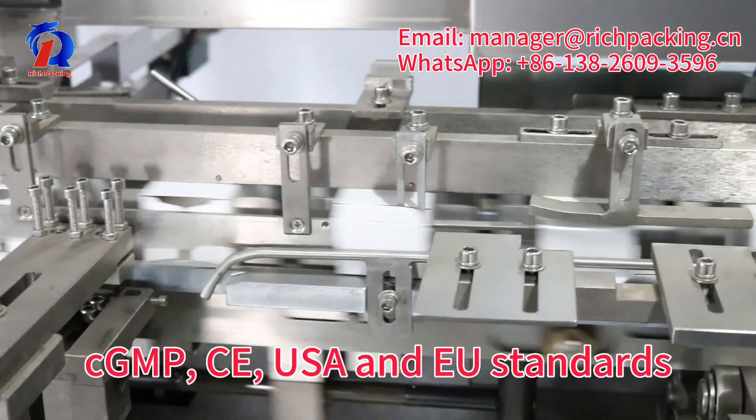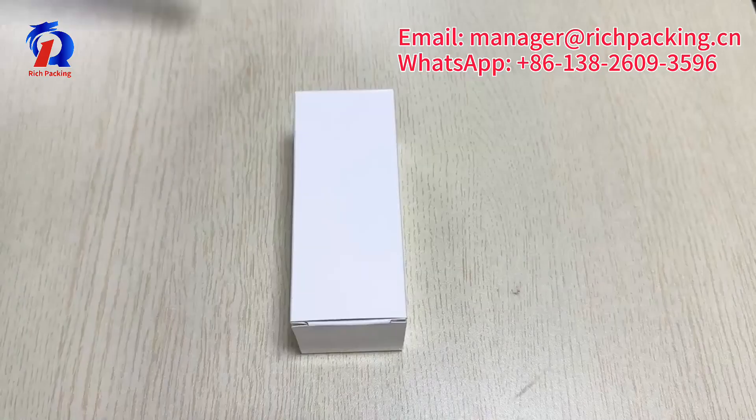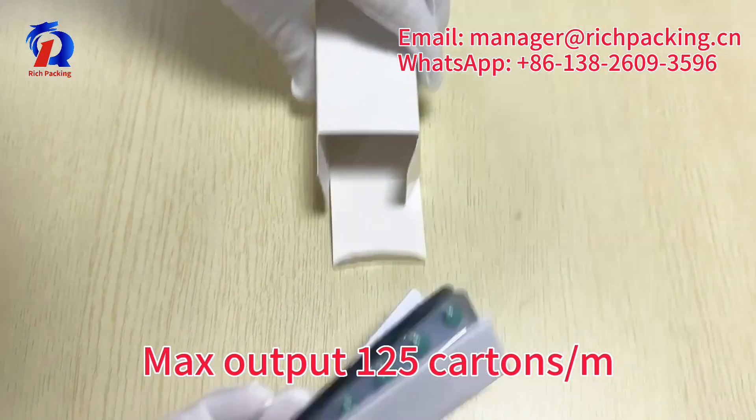Fully mixed cGMP, CE, USA and EU standards. Mass output 125 cartons per minute.